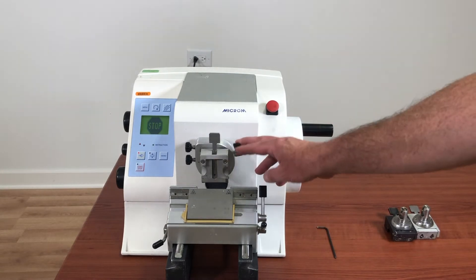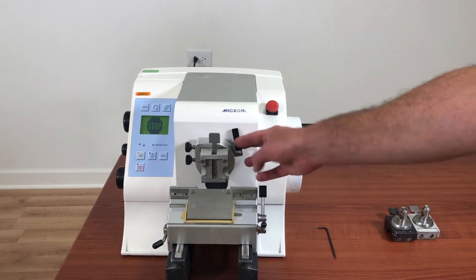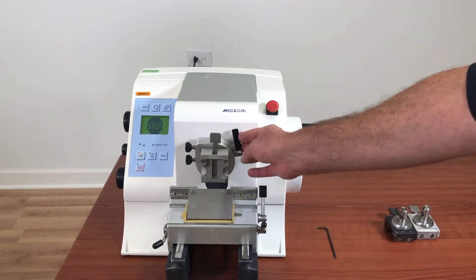This is the lever I'm talking about, and you'll notice that it never engages. And as long as this thing never locks, then you'll never get your specimen clamp to lock, and you'll never get a section.